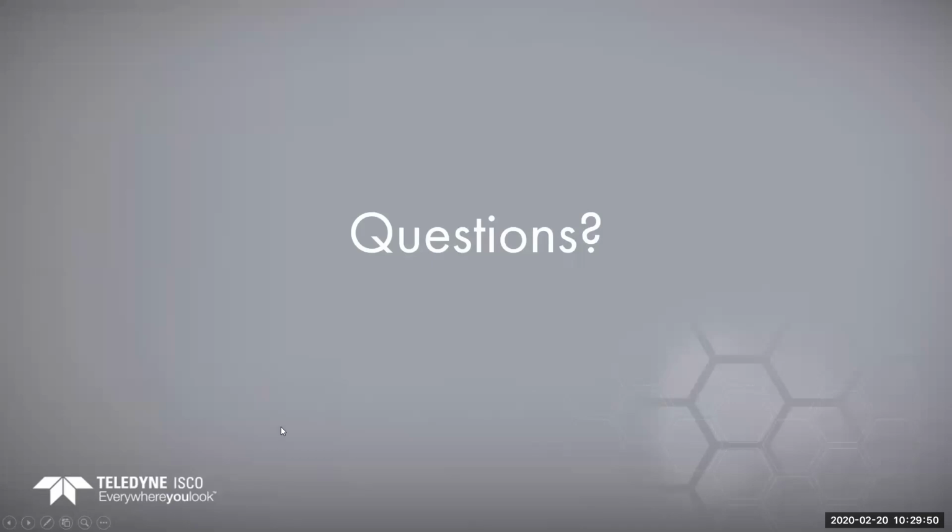So that's a very good question. So the very first question is, what is 179 for a 180 compound? So the target on the mass that we get, the compound that we're using is specified as being a 180 mass, if you look it up in Aldrich or whatever. The difficulty with having just a single mass is the fact that, remember how I said we were at a 0.5 resolution all the way up to maybe a 0.7 resolution? We're going to be actually looking at a couple different things.